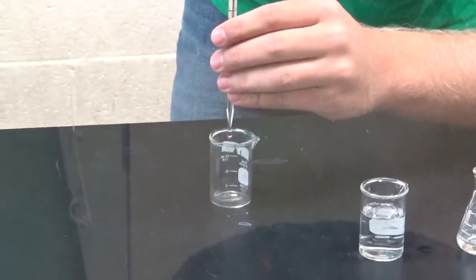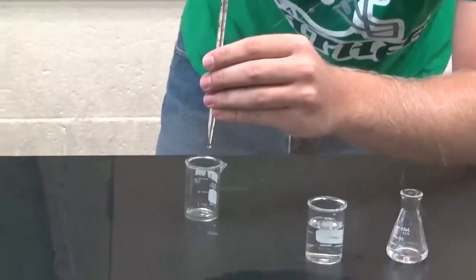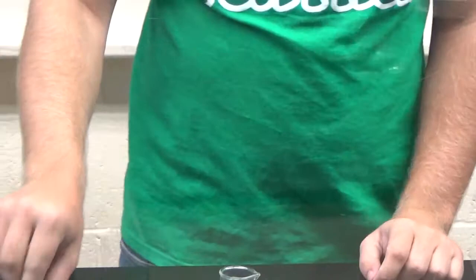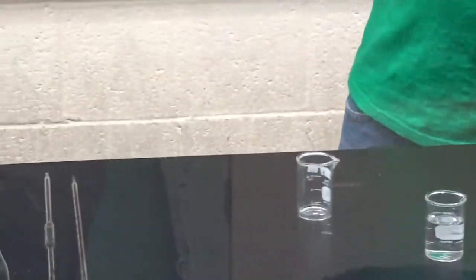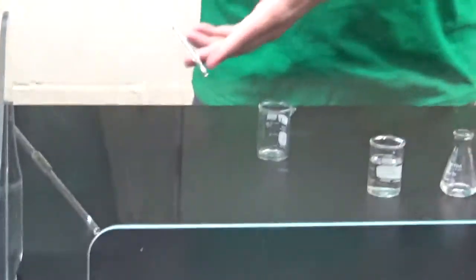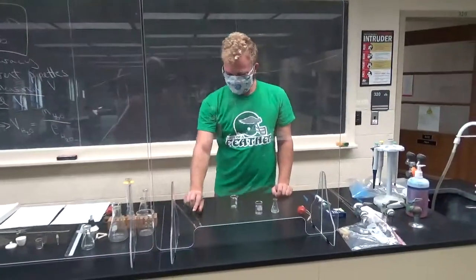He's just going to put the other into a waste container. Both of these first two, actually all these pipettes, are called T-D instruments, to deliver. So they are delivering the volume. That's why there's a little bit of water left over in there, because it only drips out the volume there that says. Sorry, kind of taking a picture of the bench.